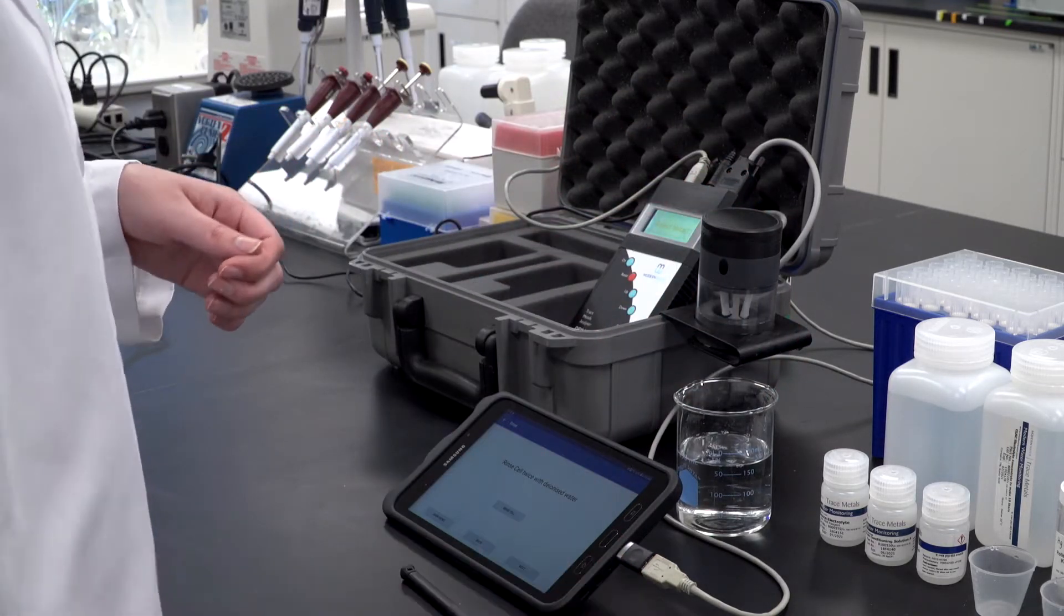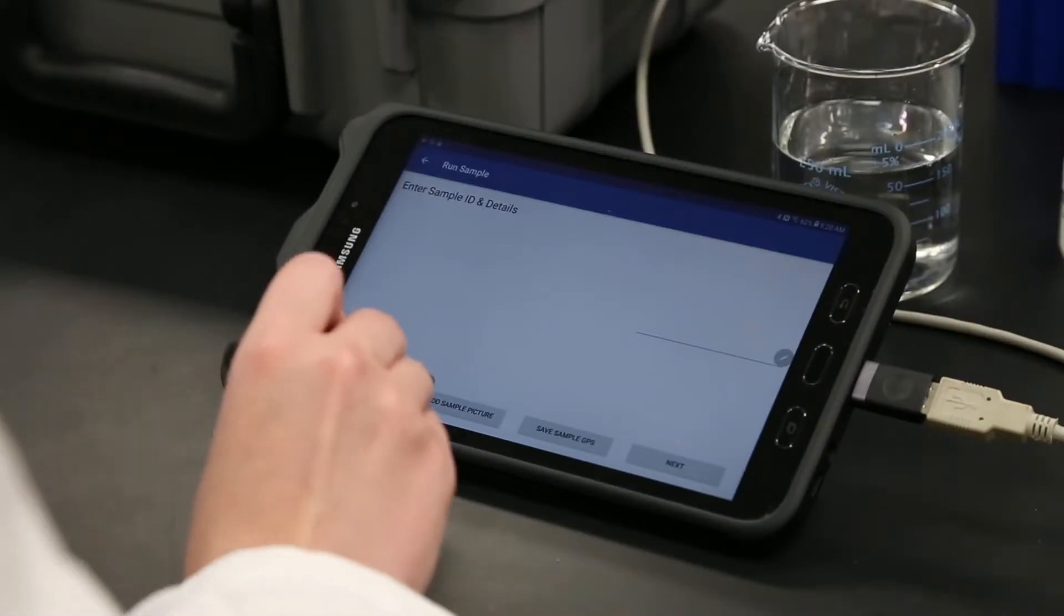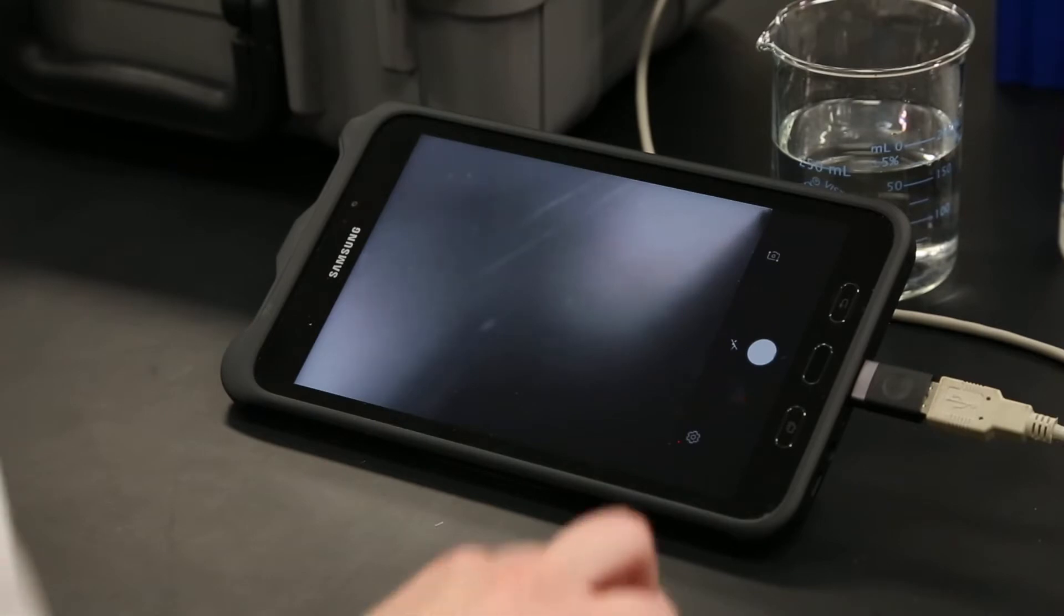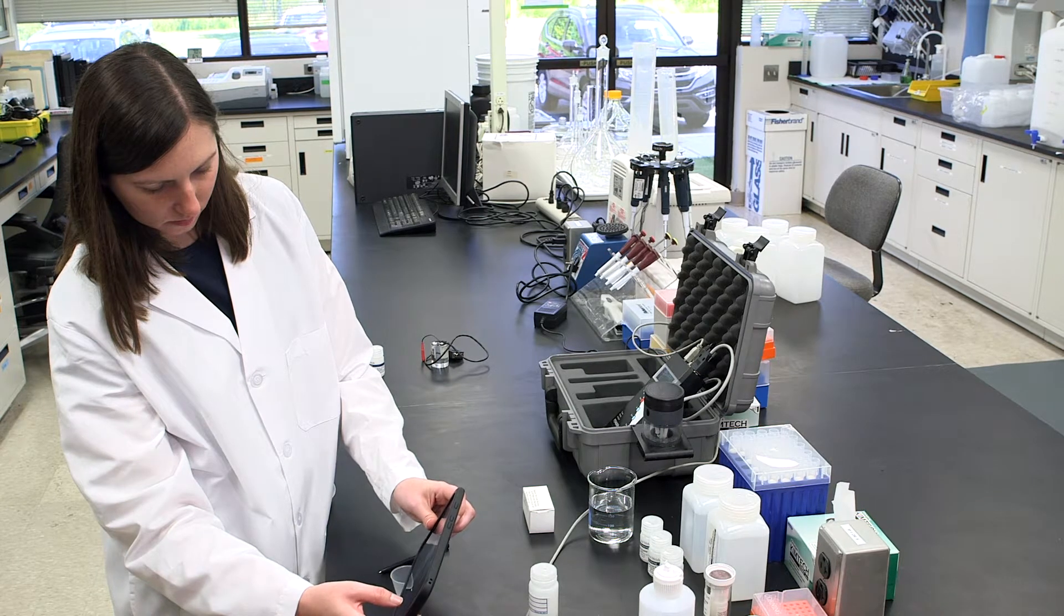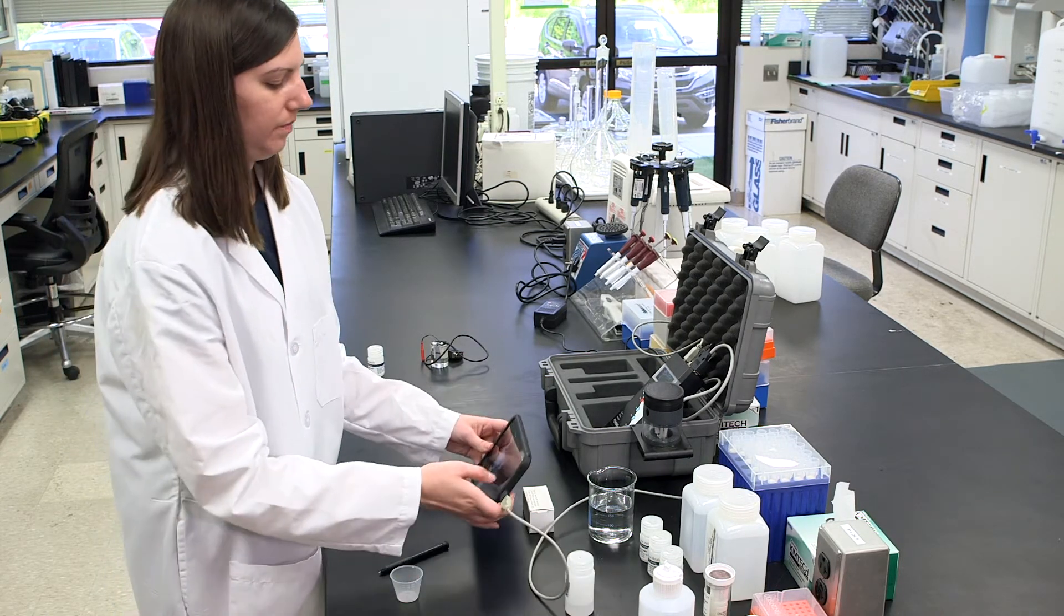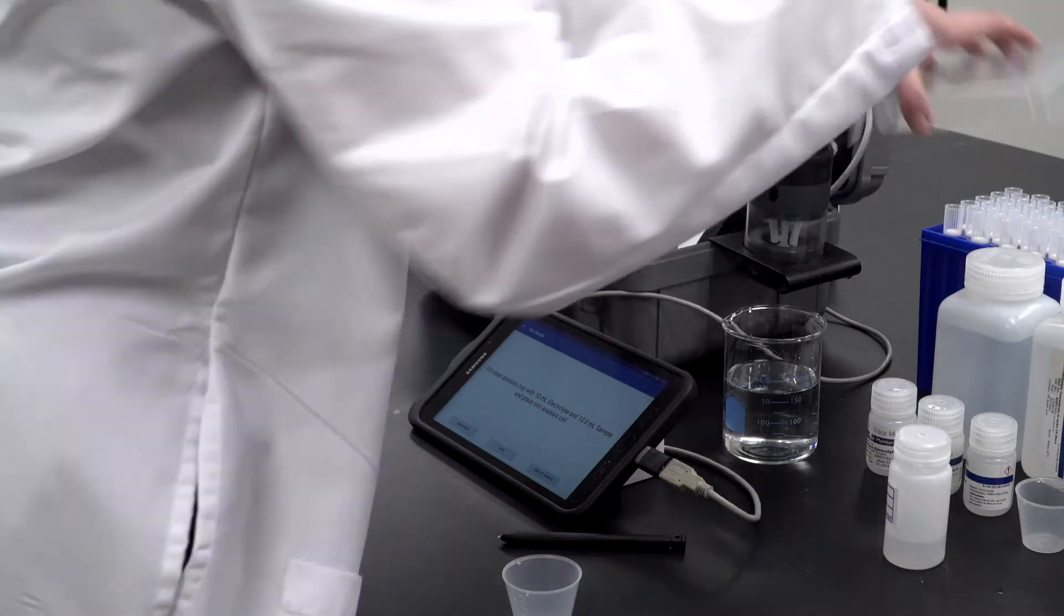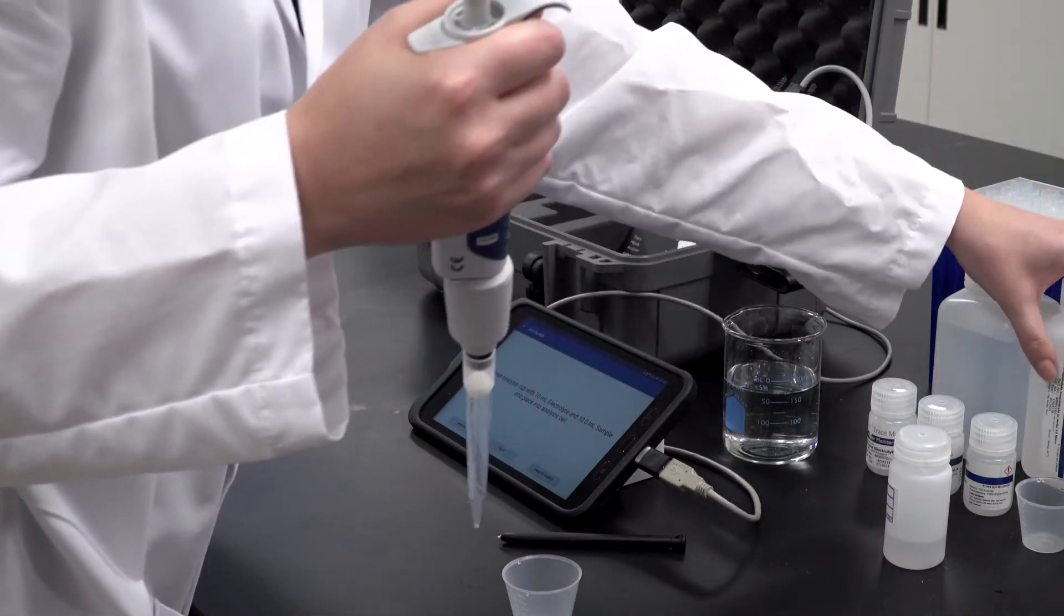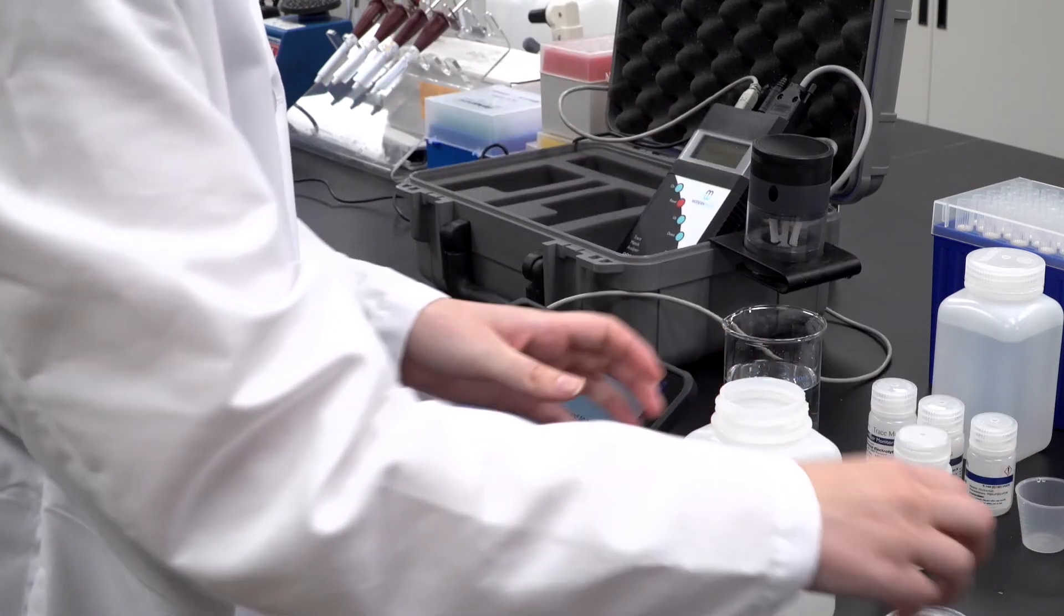The Sample ID and Details page will now open. This is an opportunity to enter a sample ID name, number, or description. If sample GPS and/or picture options have been selected in the Options page, then options to use these functions will also appear here. In a clean analysis cup, prepare a sample solution as described on the app window and place it in the analysis cell. Click Analyze Sample to initiate the analysis of the sample.